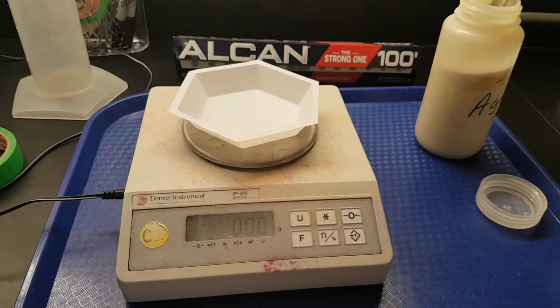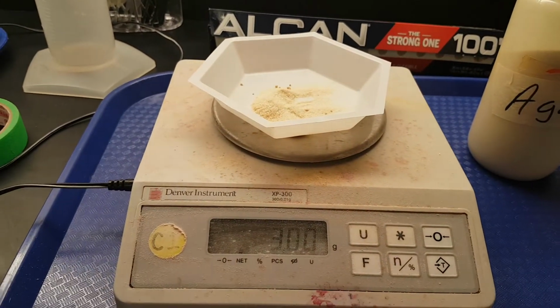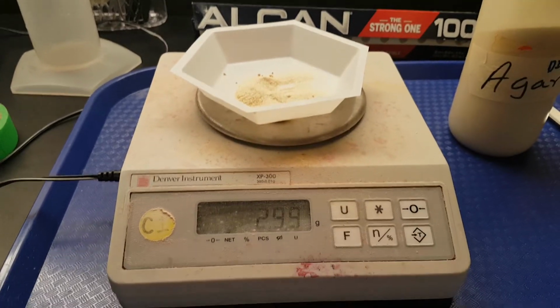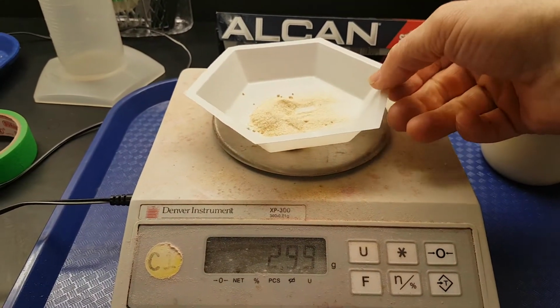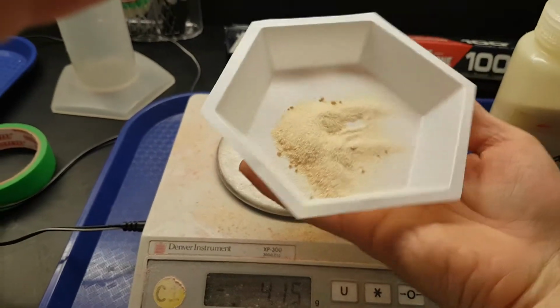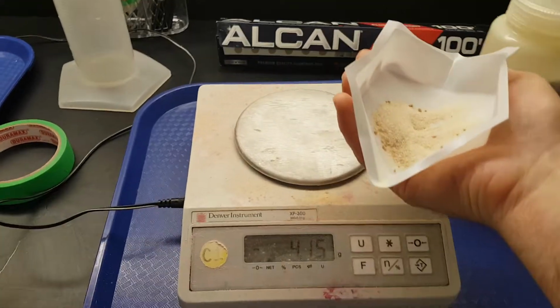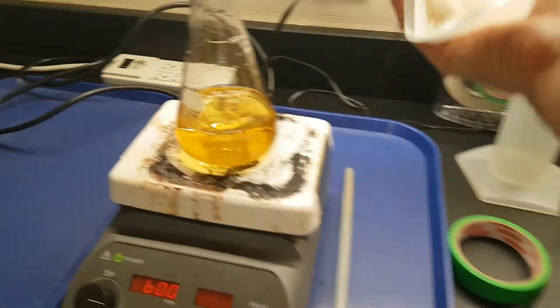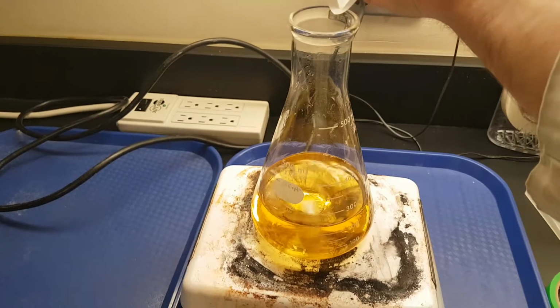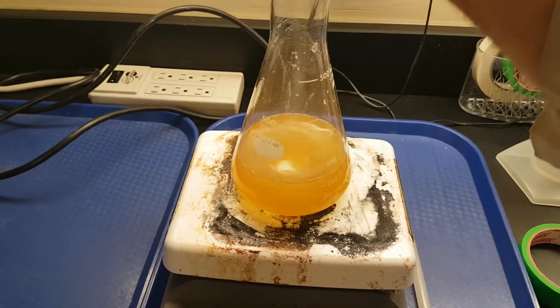So we'll go ahead and weigh that out and come right back. And there we have it, 3 grams of our agar powder. It keeps jumping around again. It really doesn't matter. Just get it close enough, within 2 or 3 hundredths of a gram, and you're good. Really doesn't matter. Don't waste the time trying to get it super perfect. Okay, and then all you do is you add that.